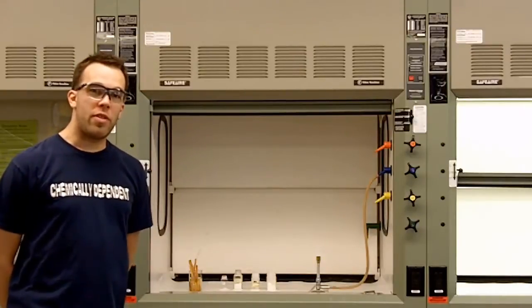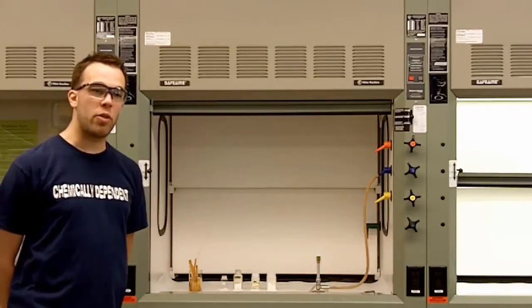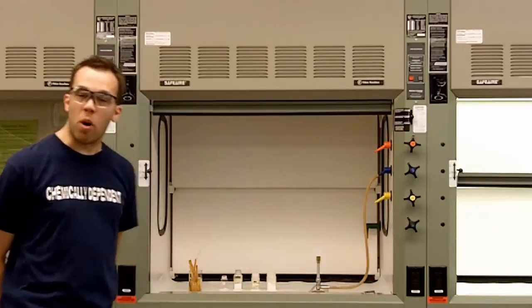What we will be doing today is the traditional flame test, with the sole exception of instead of using a nichrome wire, we are instead using soaked wooden splints, which are just dampened with water.